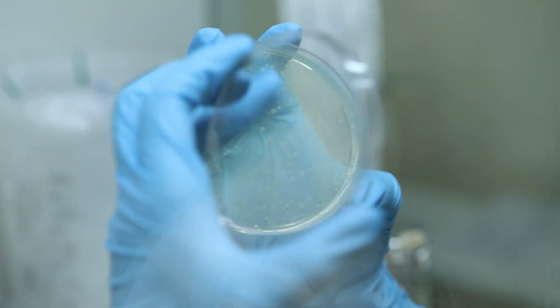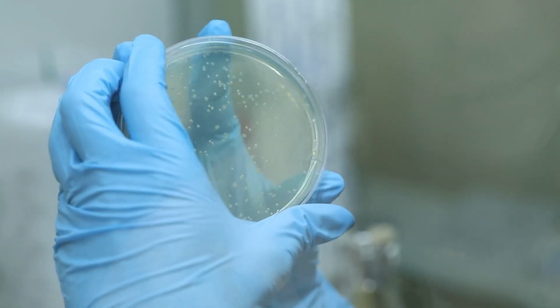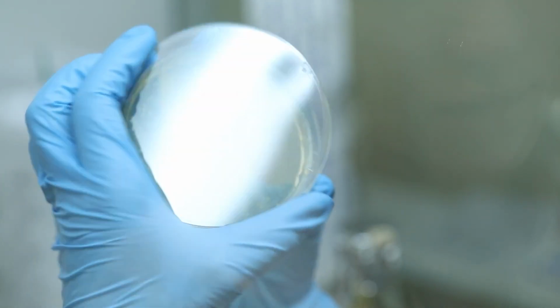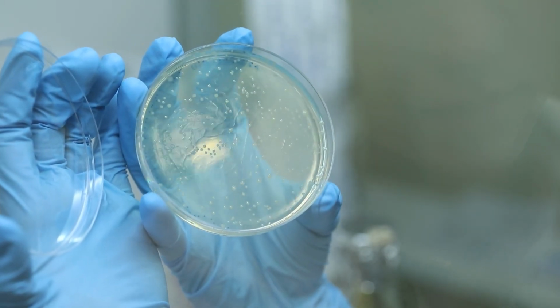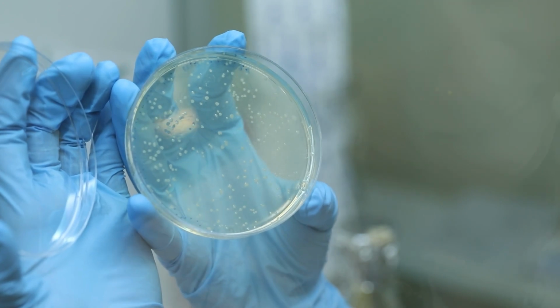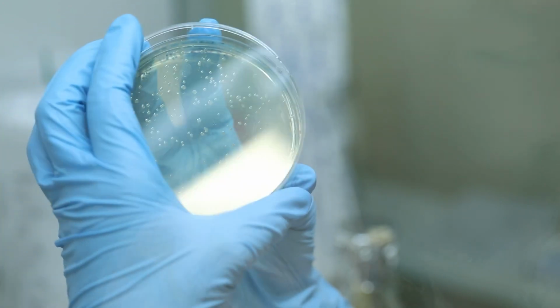In the afternoon, we recover the plate with the transformed bacterial cells. As you can see, single colonies are visible. We can now make an overnight start culture that will serve as a seed for our large-scale cultures tomorrow.